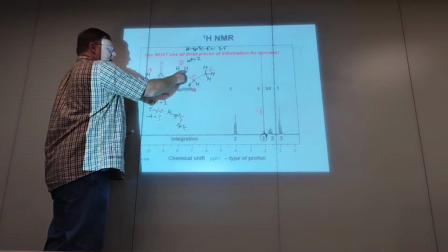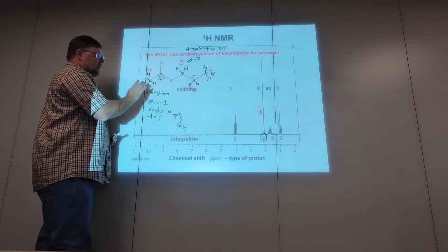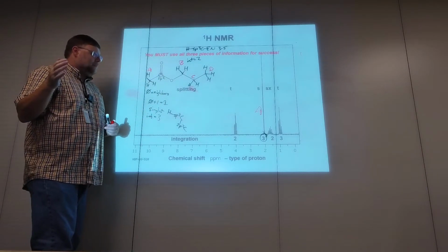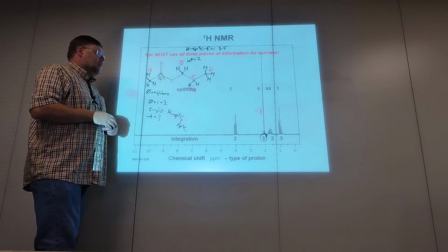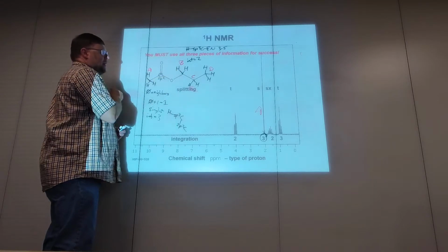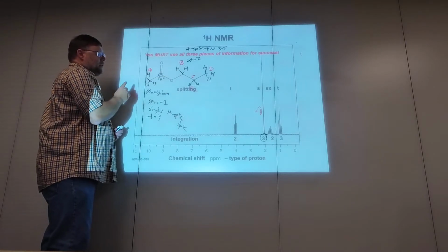So these 2 protons are going to make one signal. They're magnetically equivalent. Again, I have a video on that. My PowerPoint will show that if you need to look at it. These 2 protons are magnetically equivalent, so they're going to make one signal.